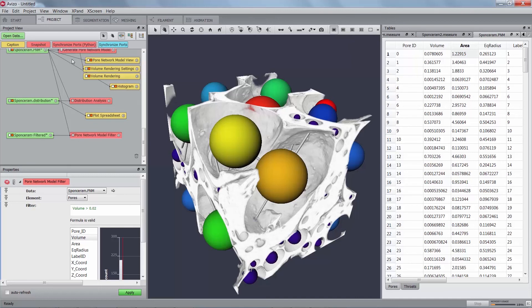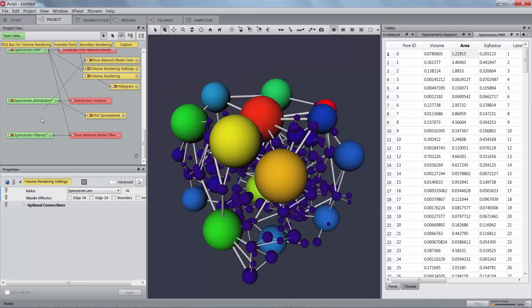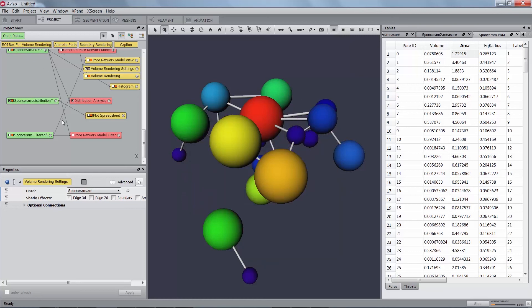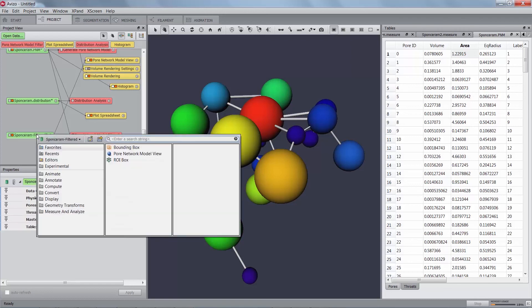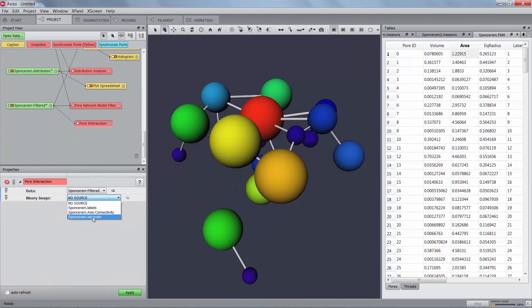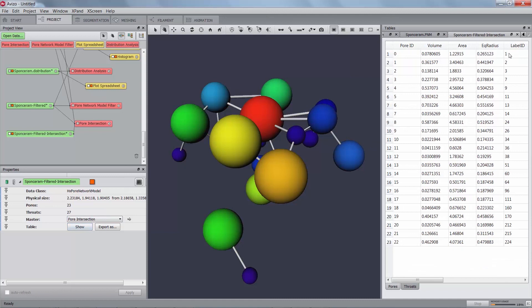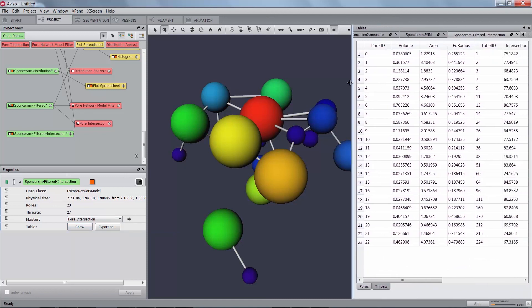You can visualize the filtered network by changing the data port of the pore network model view and setting it to the new network. The final analysis shown in this tutorial is how to compute the intersection percentage of the pores for the filtered network. Create a pore intersection module on the last result and connect the result of the separate objects module to the binary image port. The module will output a new pore network model including an intersection column that represents the percentage of intersection with the real pore space.